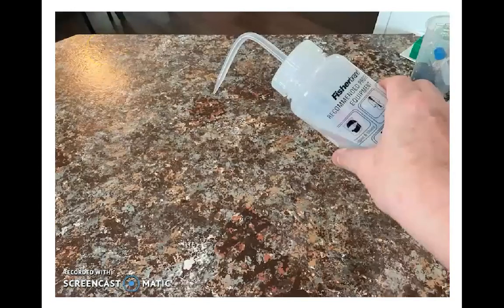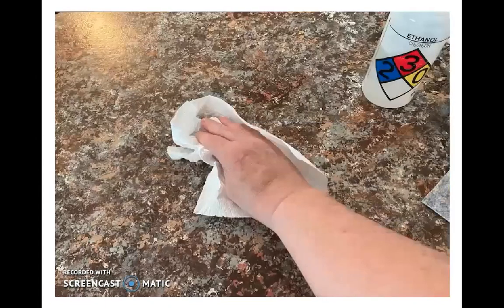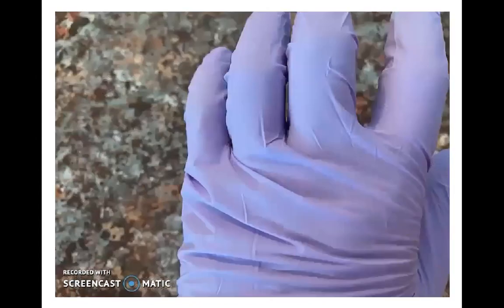So with the squirt bottle like this, we simply apply the disinfectant to the surface and then clean it off. Make sure the surface is nice and dry before you get yourself going with your work. Remember too that you have to make sure you have all of your materials gathered before you begin.